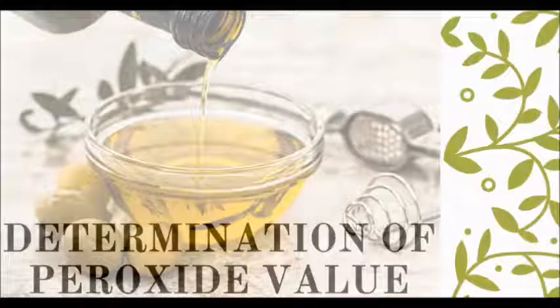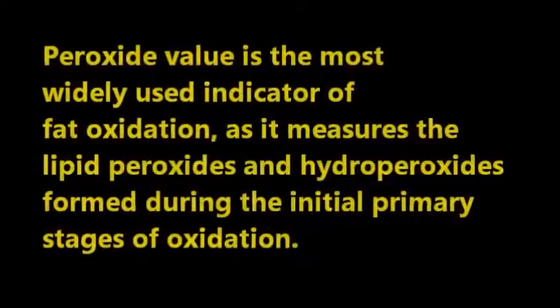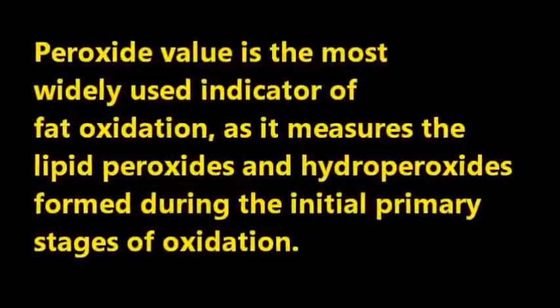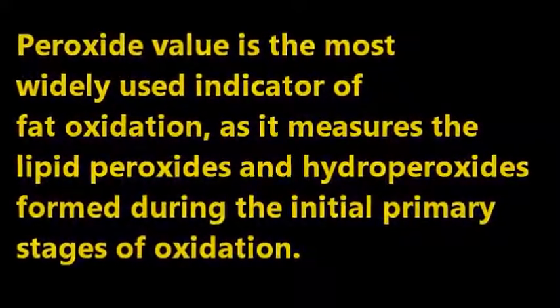Determination of peroxide value. The peroxide value is the most widely used indicator of fat oxidation as it measures the lipid peroxides formed during the initial primary stage of oxidation.